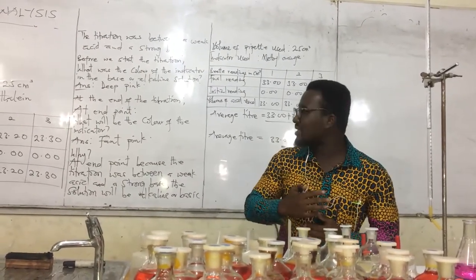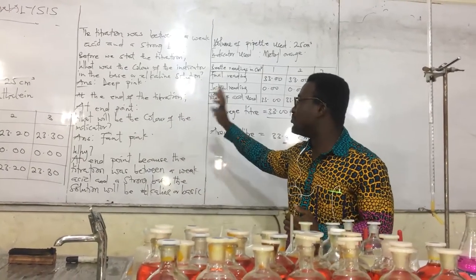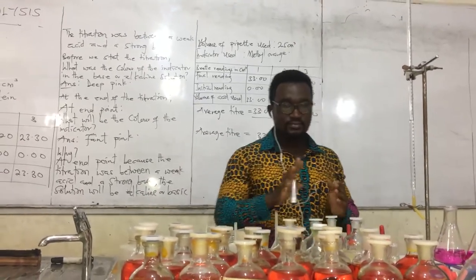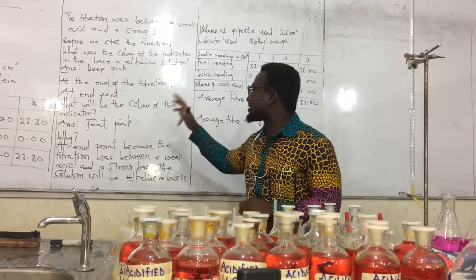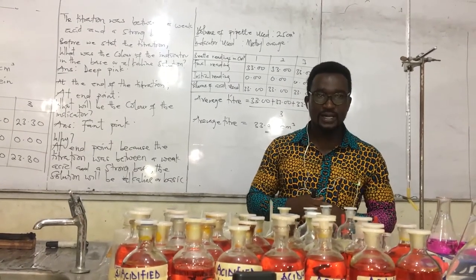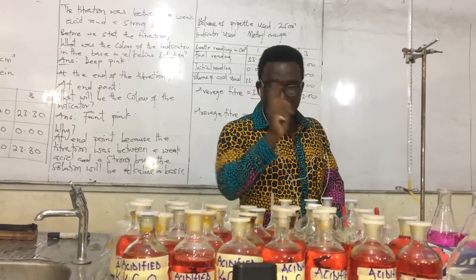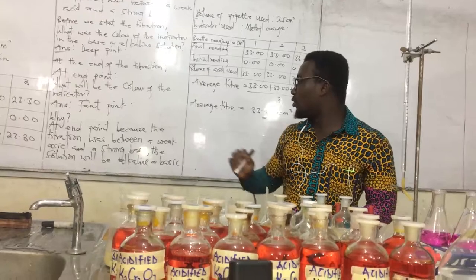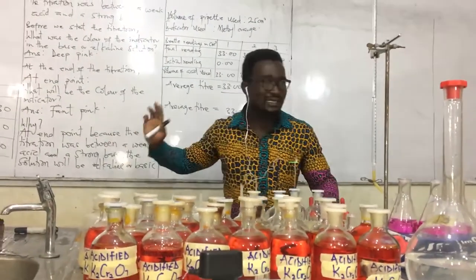Now, we have very simple questions that also follow the first one. What was the color of the indicator in the base? This time it was methyl orange. What was the color? Yellow. Now, at end point, what color change do we expect from the indicator, which is orange? I said it is almost close to red and pink, but it is not pink and then red. So that is the color change we expect.